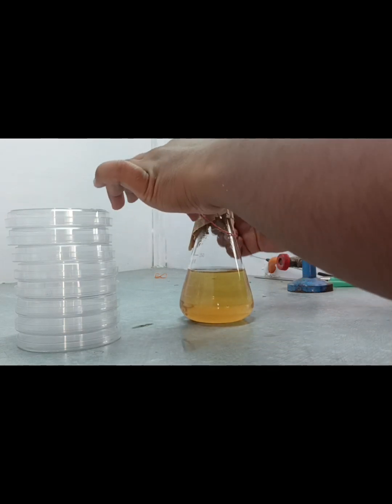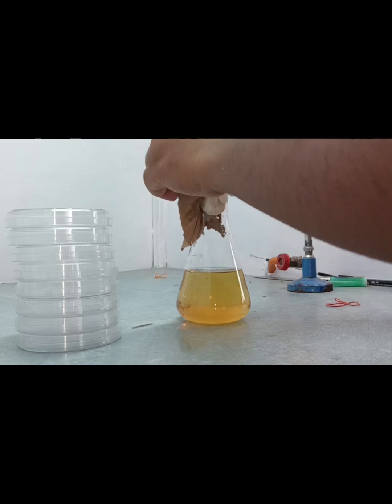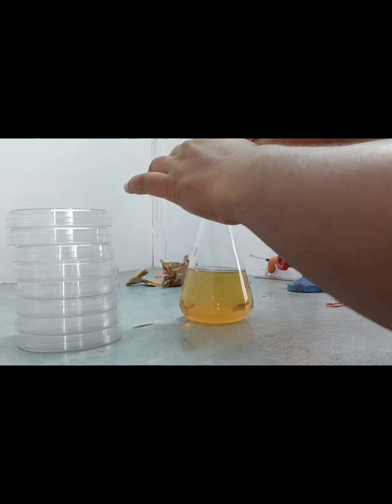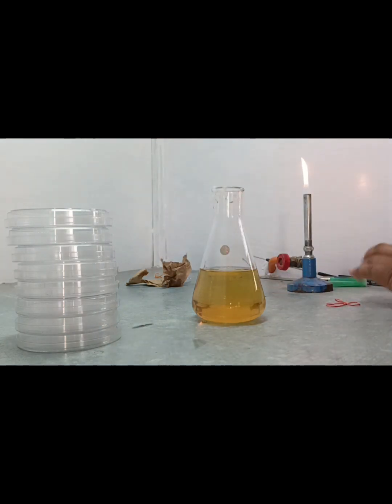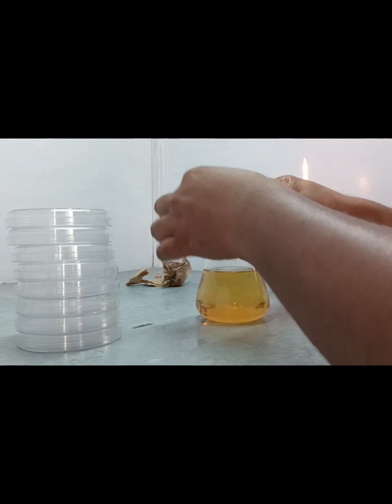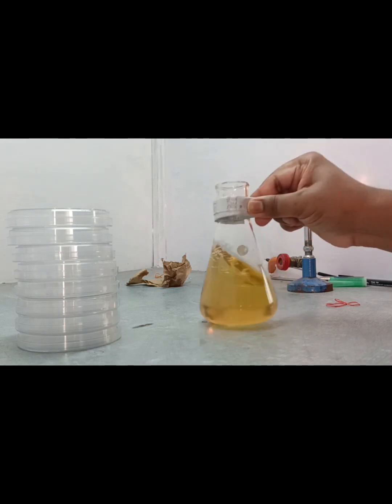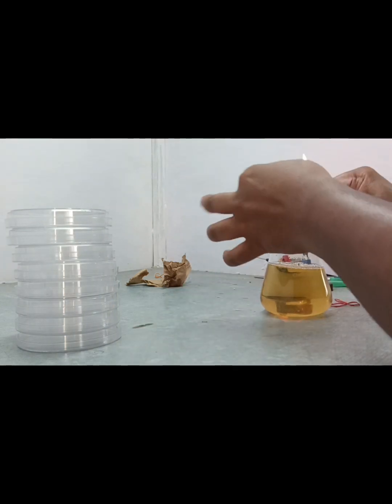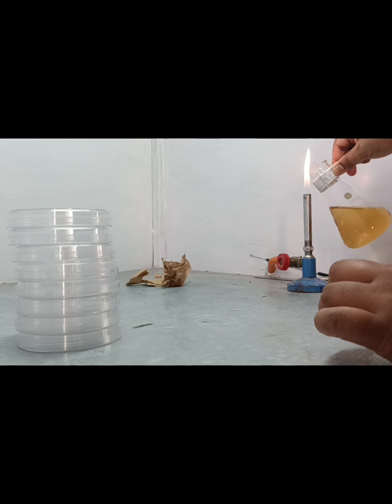First we clear the paper covering and open the cotton plug. After that, we mix the solution carefully, including the mouth portion of the conical flask, like this.